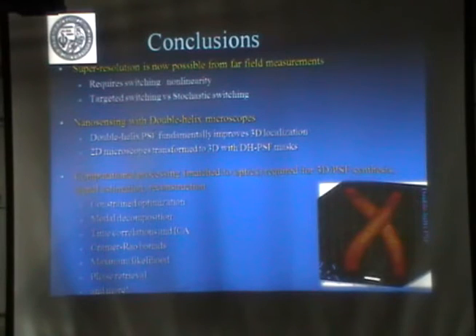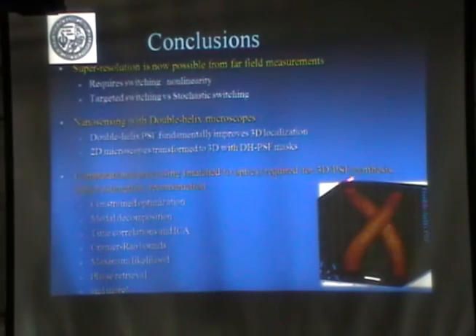Now, I showed how you can do sensing using these double helix microscopes. You can do localization, tracking, dark field, and so on. But you can also use it for super resolution. And one philosophical thing is that you need to use a processing matched to the optics.